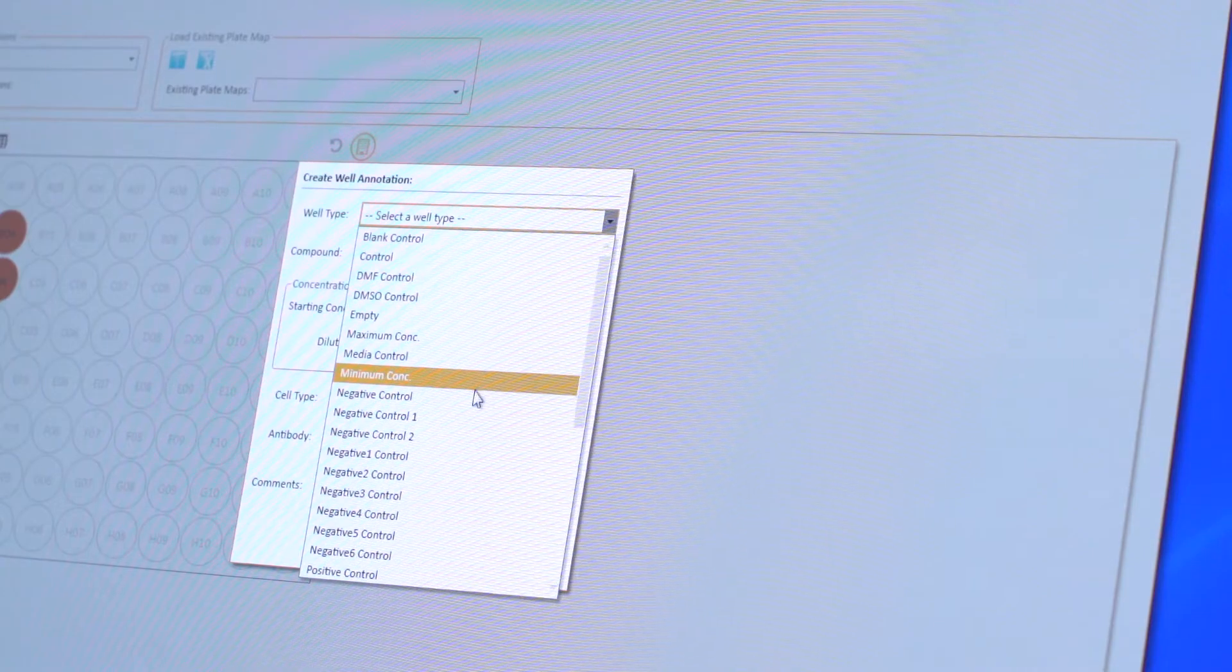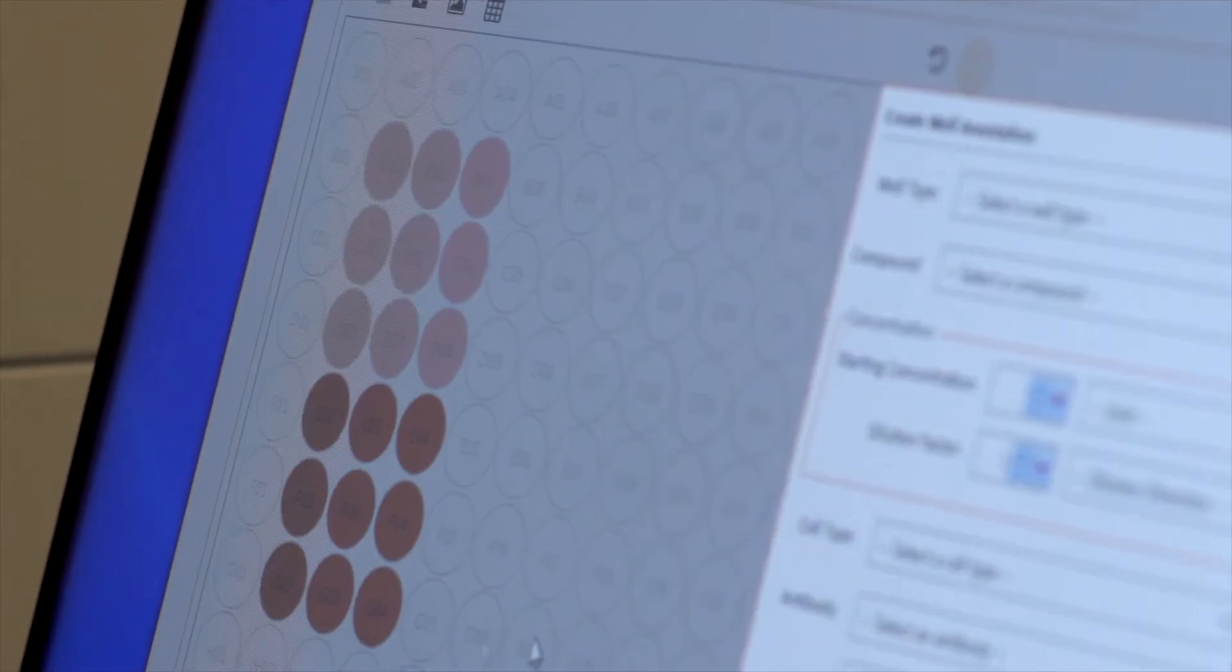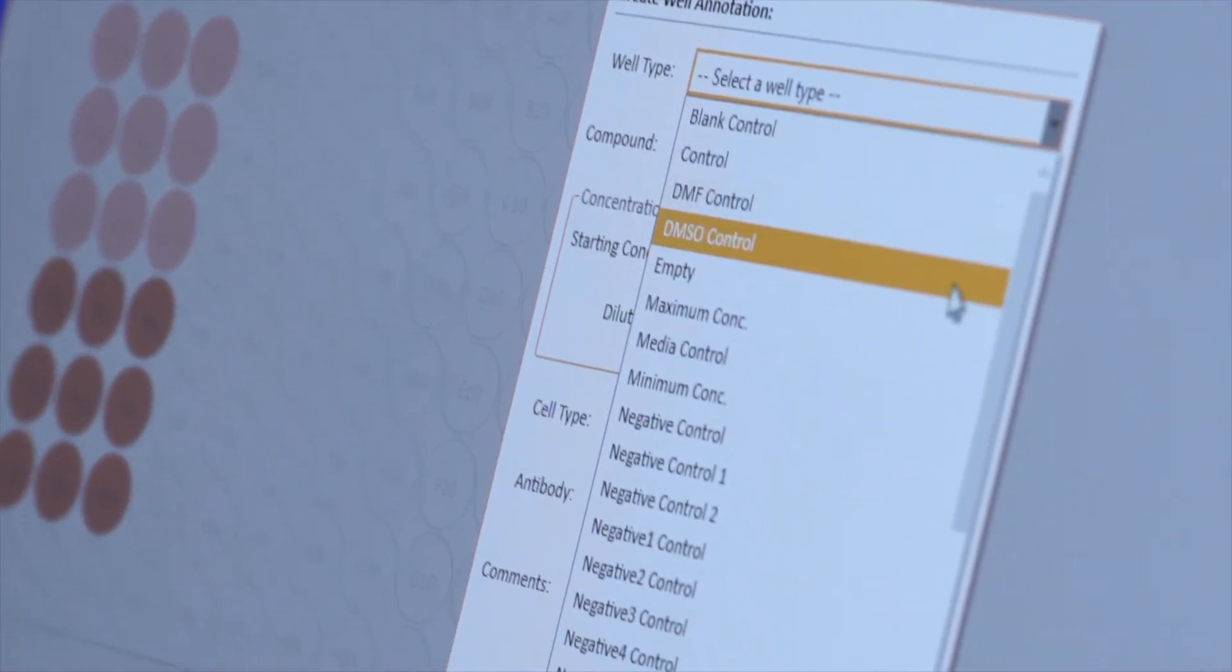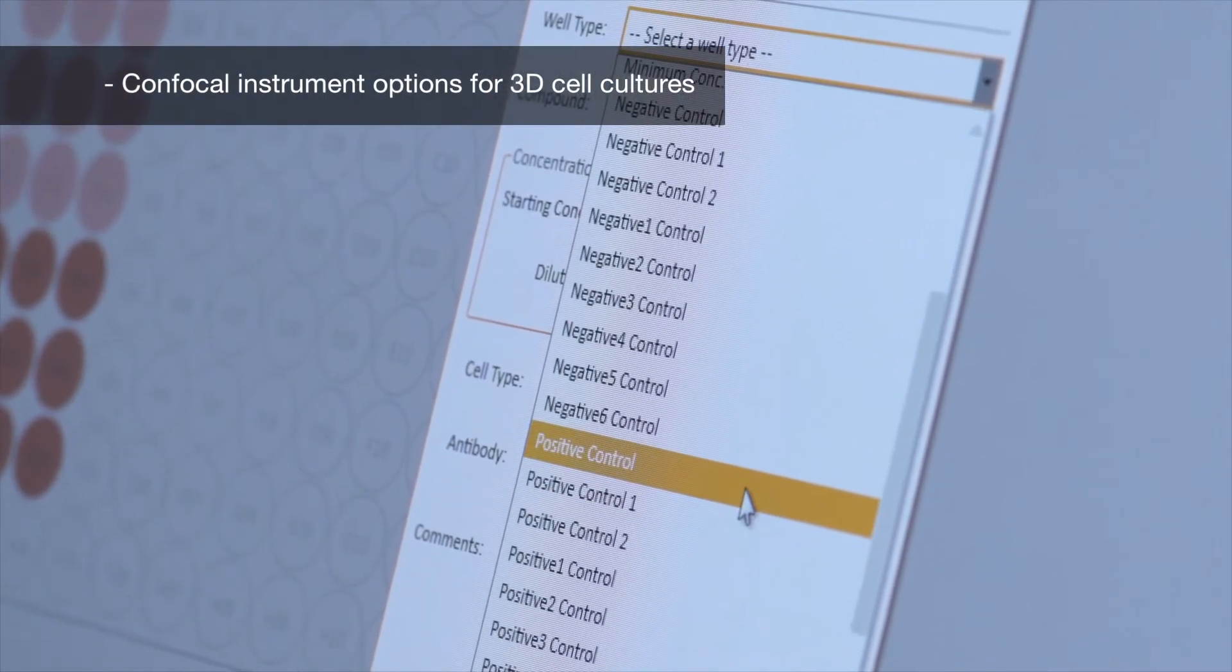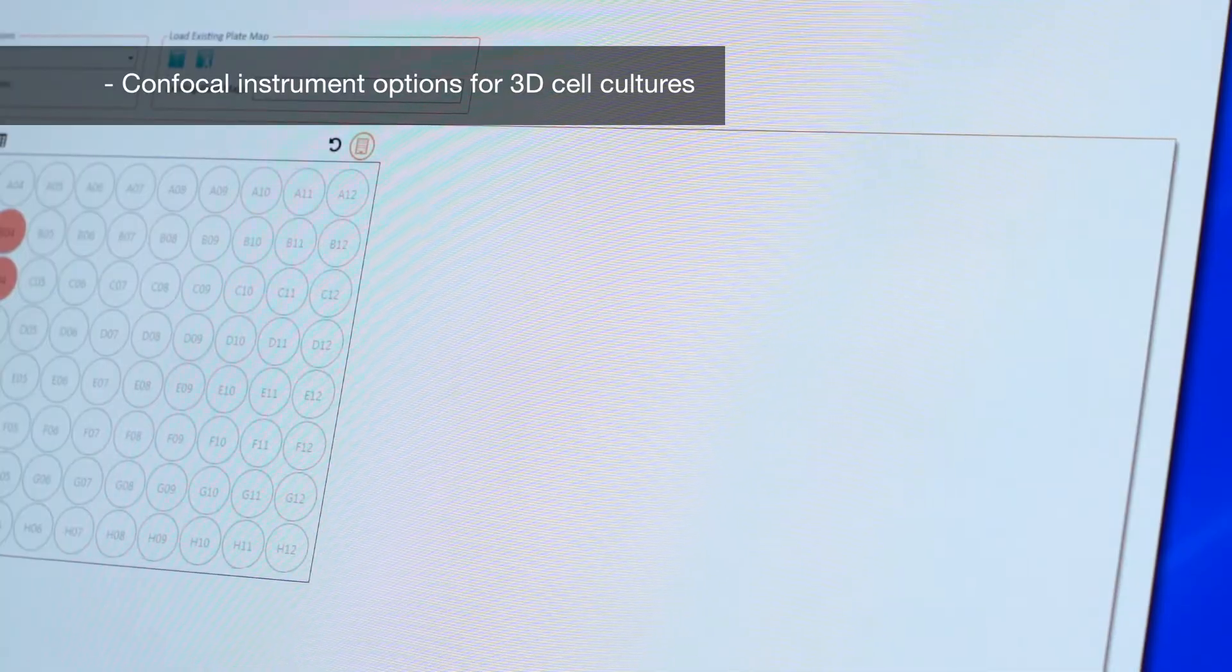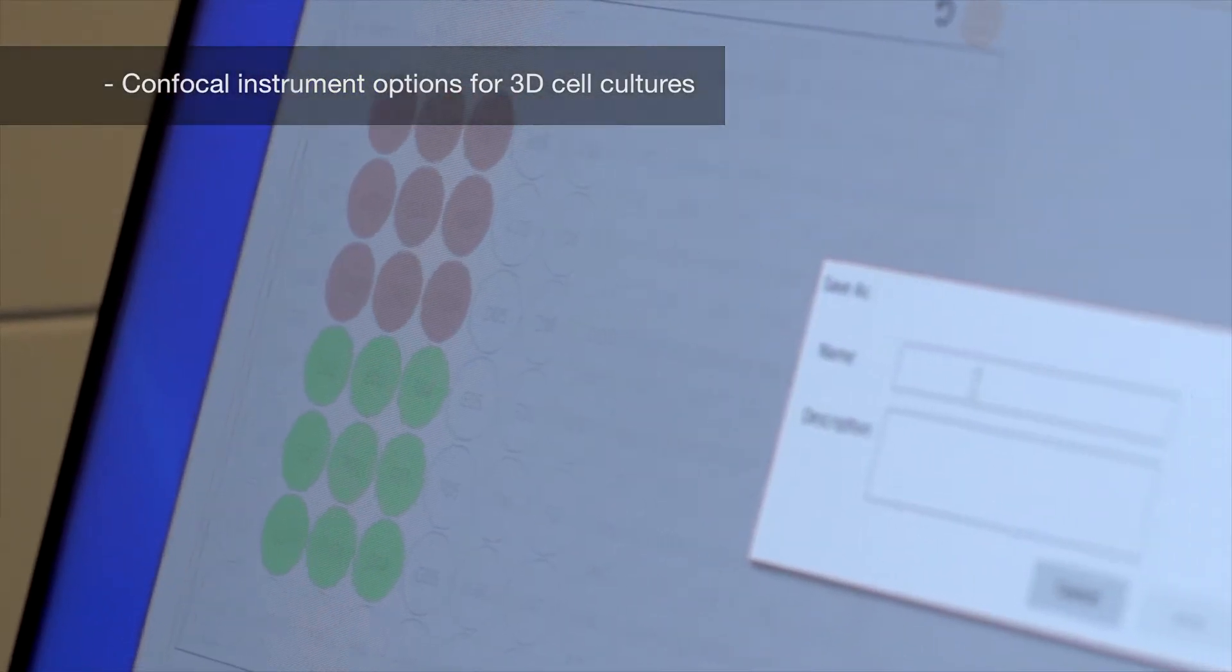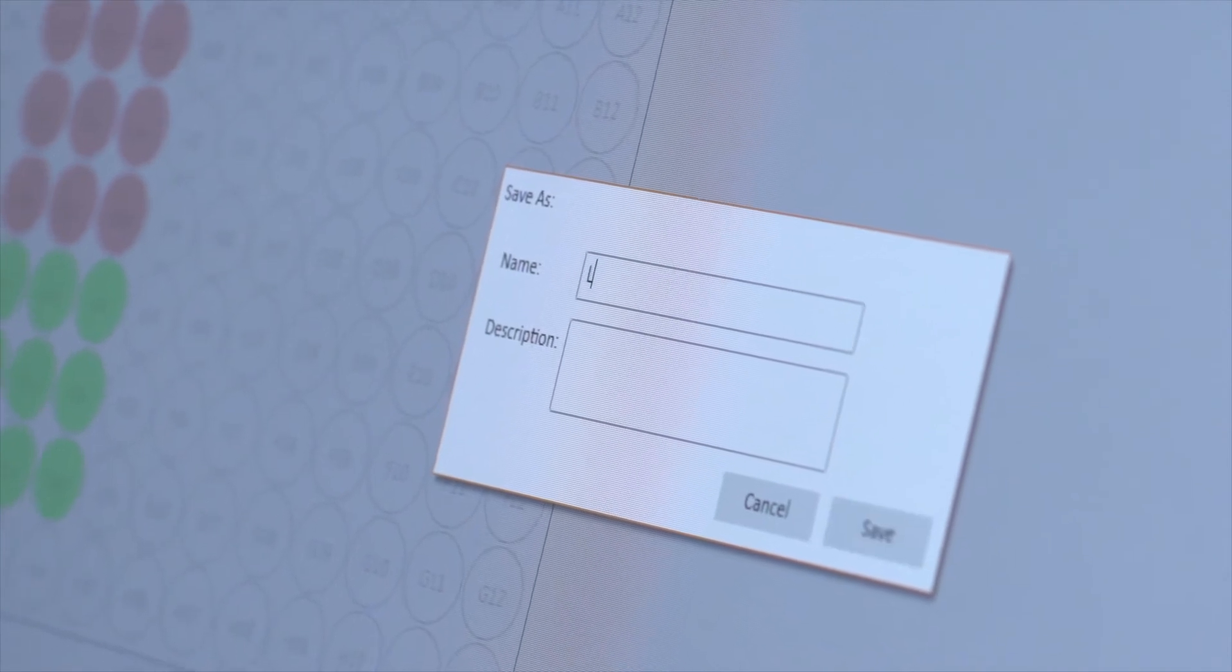The Cell Insight CX-7 System Series is also built with a powerful dual-pinhole spinning-disc confocal that captures tissues, organoids, spheroids, and multicellular phenotypes in a high-throughput fashion to help you explore the cellular world beyond 2D.